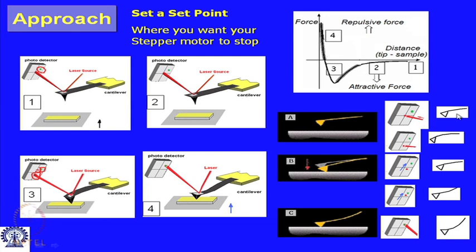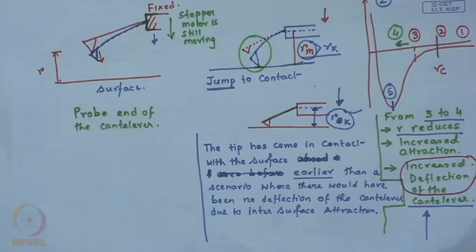to scan. So, these also capture the configuration of the nature of the deflection on the cantilever, as well as how the laser spot moves on the QPD. So, this is at the aligned position. This is when it is subject to attraction, it shifts in this direction. This is beyond jump to contact, it is now traversing back following the same path, some of the figures we had drawn.